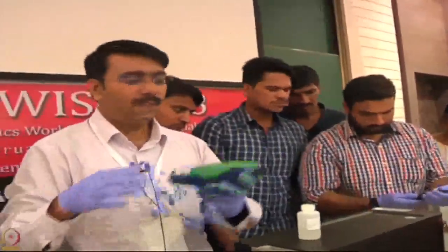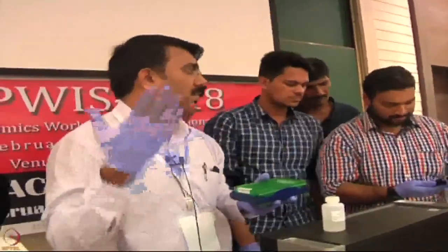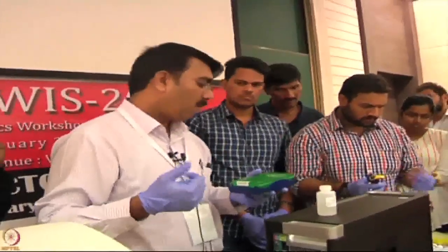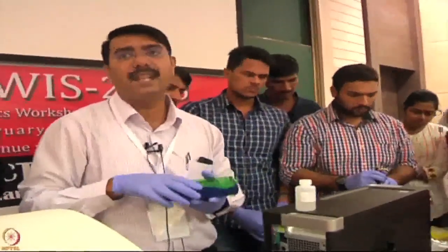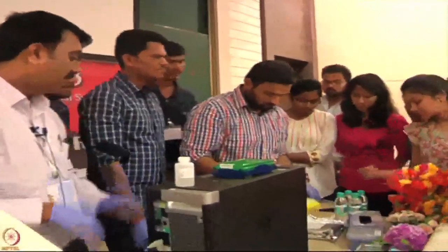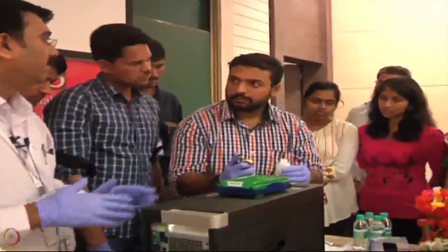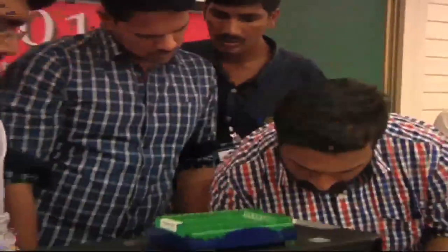Side by side, what we are doing is, these sensors are actually dry coated with streptavidin. The sensor here is the streptavidin chemistry, and I have a biotinylated protein A with me. So these sensors I will hydrate with this buffer. The minimum hydration time is 10 minutes. So add 200 microliter in each well of the first column, and column 3, 200 microliter each well. Column 1, rows 1 to 7.